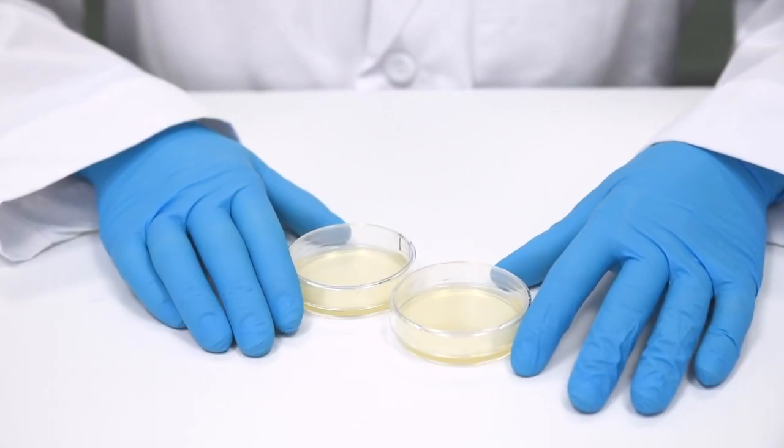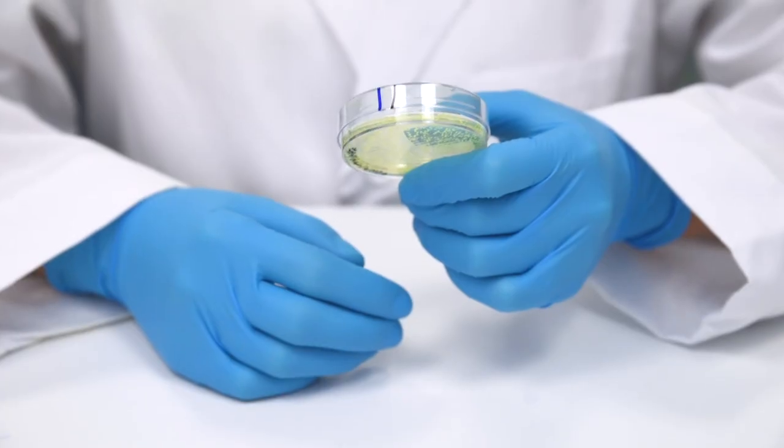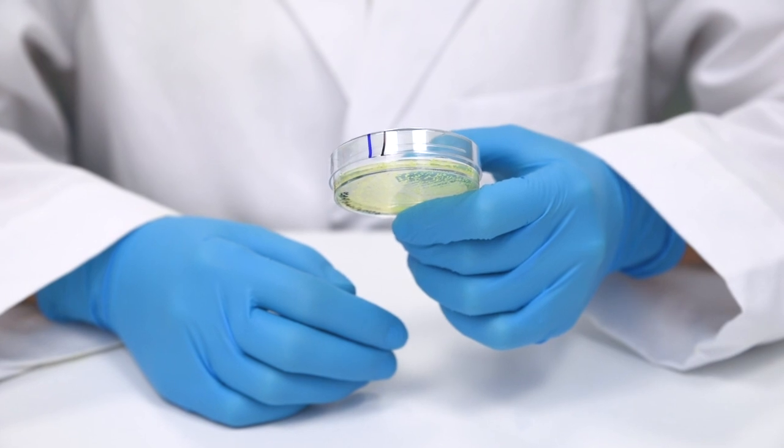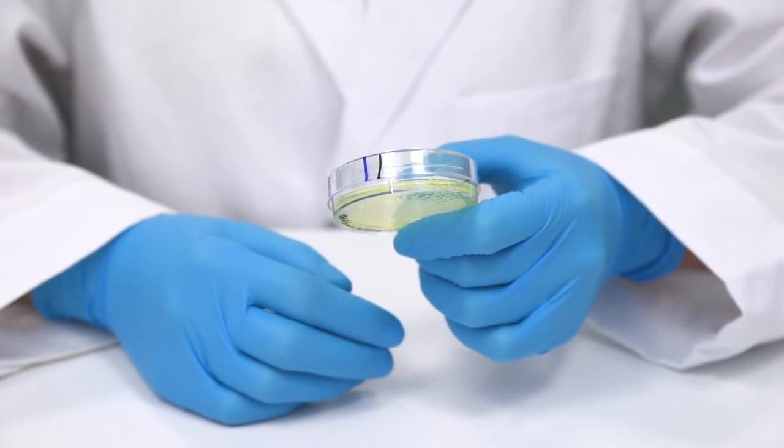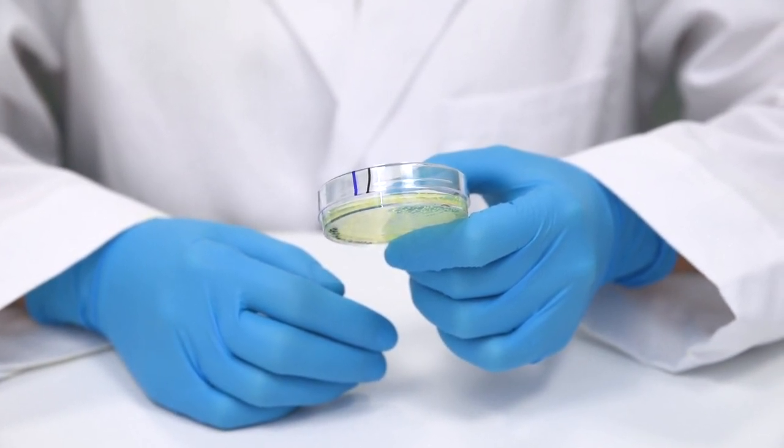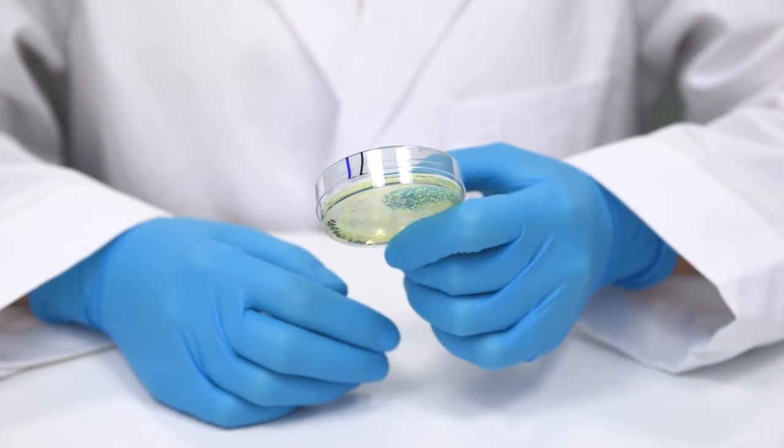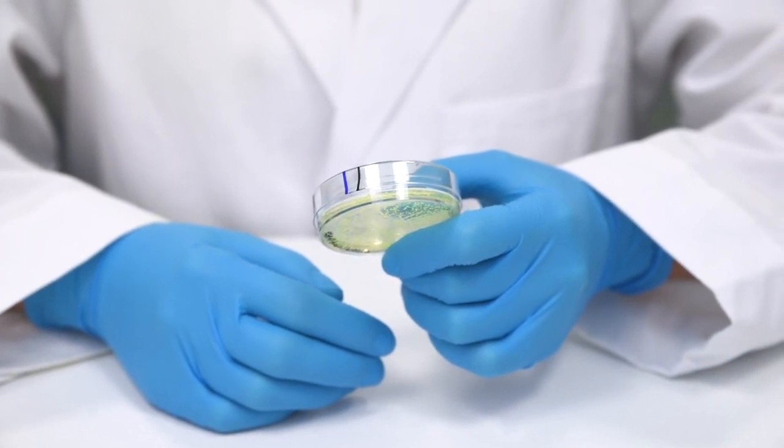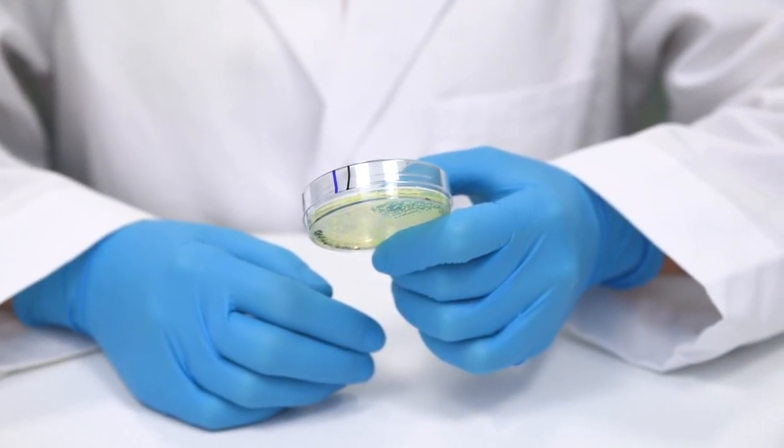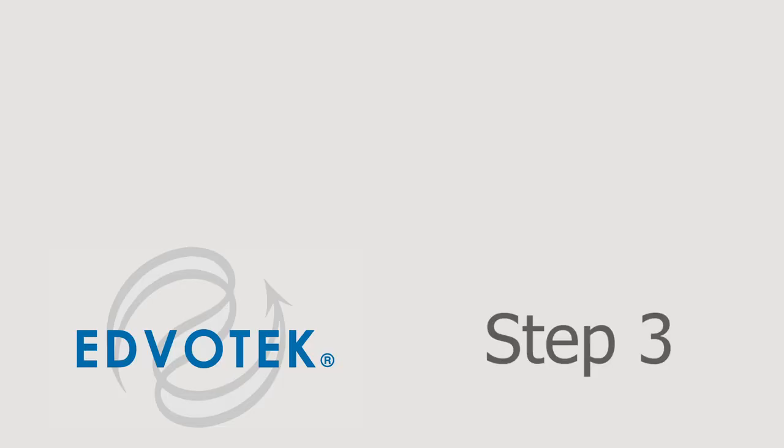Step 1: Obtain two LB amp IPTG plates. Step 2: Use your plus DNA, plus amp, plus IPTG transformation plate, your result plate from Module 1, as the source of your seed culture. If necessary, you can share a plate with another group or use a control plate.